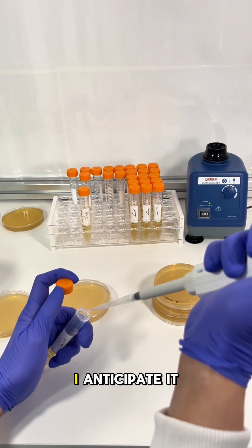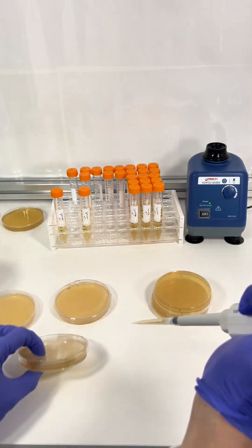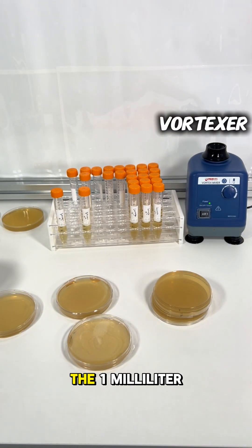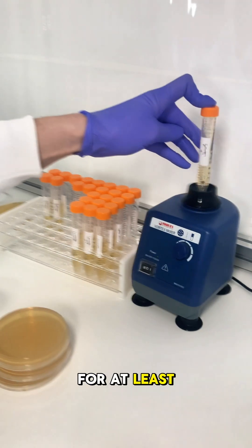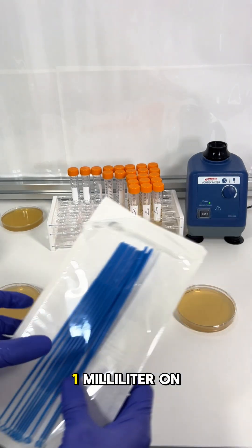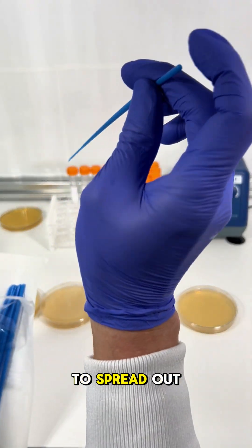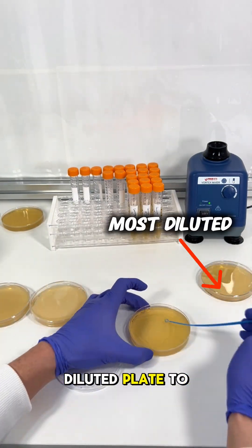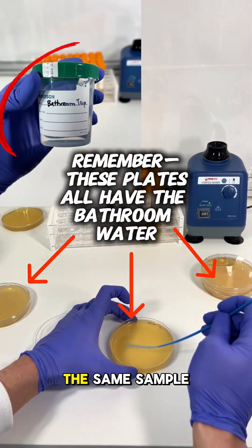In the case of Chick-fil-A, I anticipate it's fairly clean, so I've decided to only do three dilutions. When preparing dilutions, I always use a vortexer to fully mix the one milliliter with the nine milliliters — I typically vortex for at least five seconds. Then, with one milliliter on each plate, I use a sterile inoculating loop to spread out the liquid. I only need to use one loop if I go from the most diluted plate to the least diluted plate, as long as all plates are from the same sample.